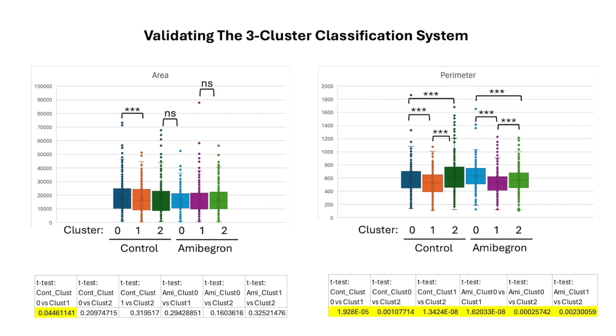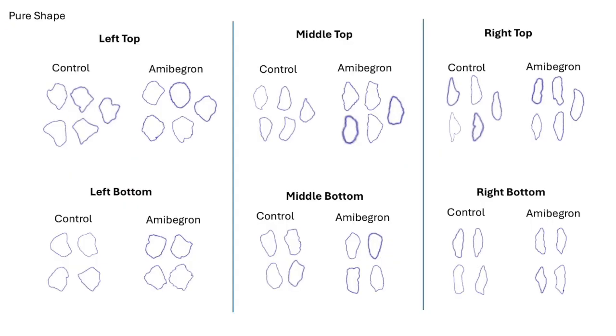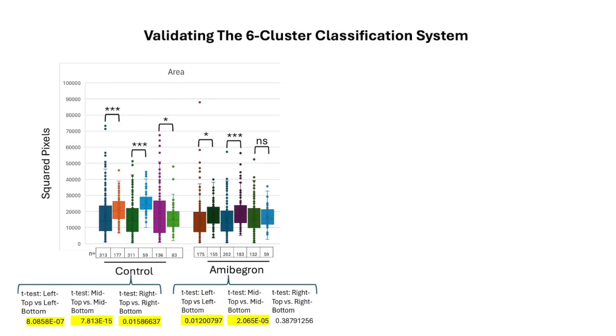But we wanted to go further because we found evidence through PCA here that there might be 6 subtypes, that is, 2 in each of the 3. So we wanted to see if we could validate the existence of these 6 subtypes using something other than what was measured in ShapeGenie. Just as a reminder, here are the middle 5 samples from each of the 6 subtypes.